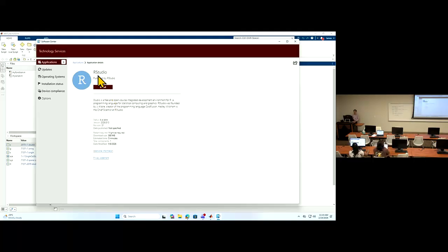I hope this RStudio will come with R together. So I just try to put RStudio on my local machine. If you already have that, you don't have to do this. You just need to know where you installed R. Then in MATLAB we will make a link so it knows your R is installed there, and that's all we need to know.